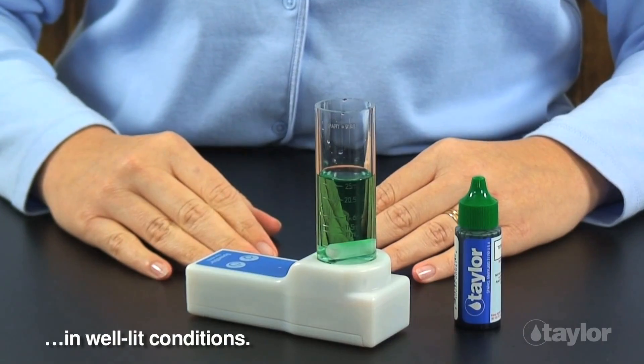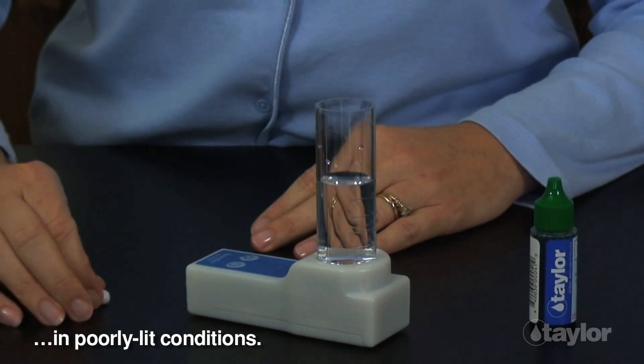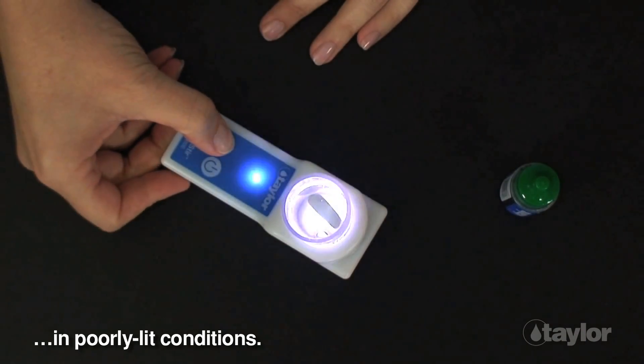If the ambient light is poor, push the button with the light bulb icon and six LEDs below the mixing platform will light up to make color changes in the test sample easy to see.